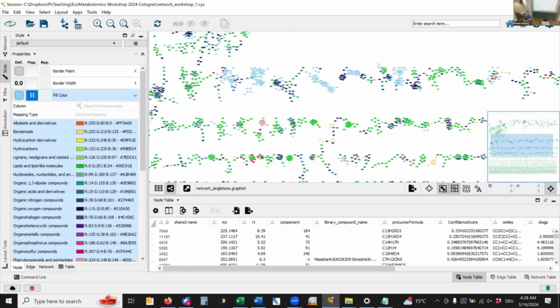Okay. Now, with regards to prioritization, there's of course different levels I can look at this, right? So here, chemical properties or structural identities, this is one way. But then I can of course also say, well, I just care about the compounds that are really abundant because I want to do compound purification downstream and I don't want to even deal with the trace amounts of something that is in there. So we could now display the size of the nodes according to the intensity.